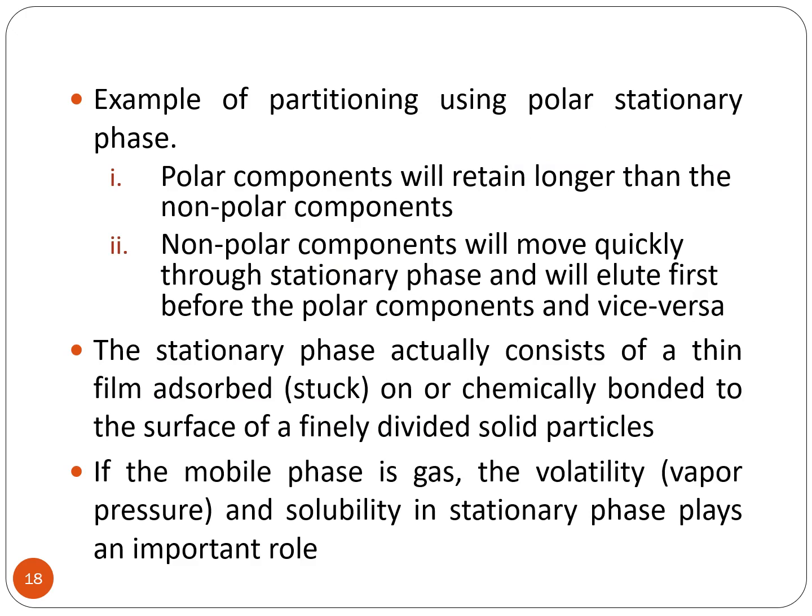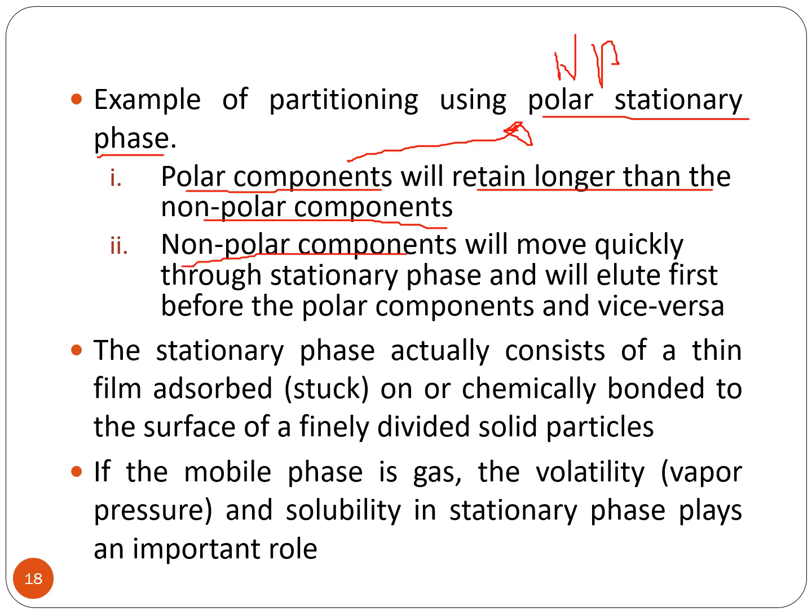Okay, partitioning using polar stationary phase. Okay, if our stationary phase is polar, ni dalam normal phase lah kan. Okay, so polar component dalam mixture akan retain longer than the non-polar component. Sebabnya polar component dia akan dissolve dalam polar stationary phase. So, polar component akan retain longer in the stationary phase. Manakala non-polar component tu tak akan retain longer. Di sebaliknya, dia akan move quickly through the stationary phase and will elute first before the polar component and vice versa.